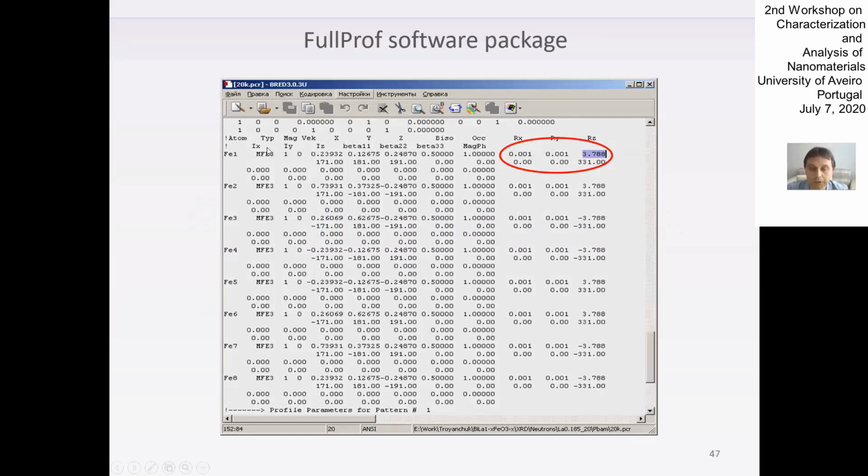For the magnetic structure, we can also put in the ions responsible for it. In the case of this material, it can be iron or cobalt, which are magnetically active. We can also refine the magnetic moment ascribed to a particular ion and the direction of the magnetic moment. So this information is in the file which we have to construct to refine the crystal and magnetic structure.